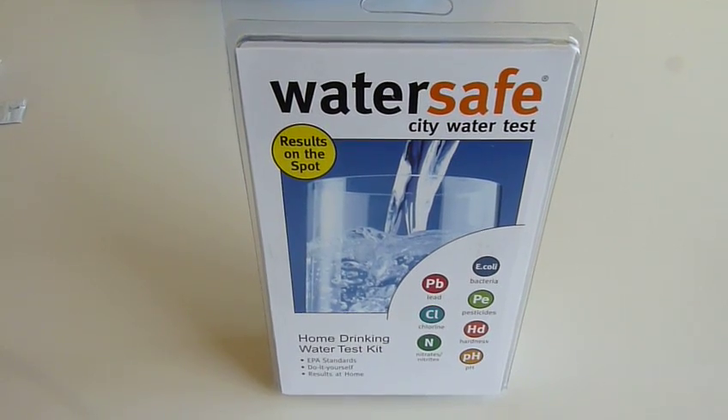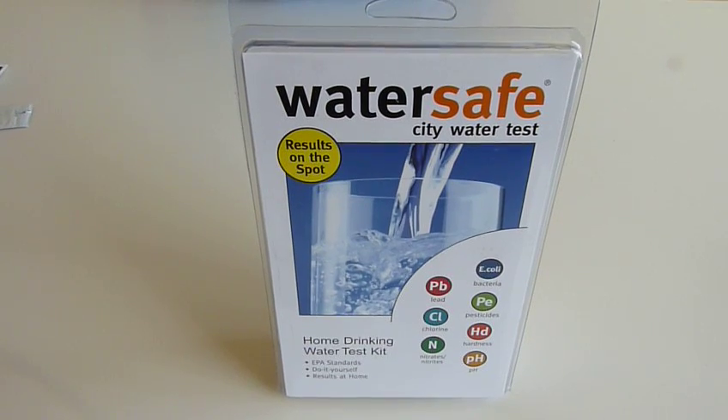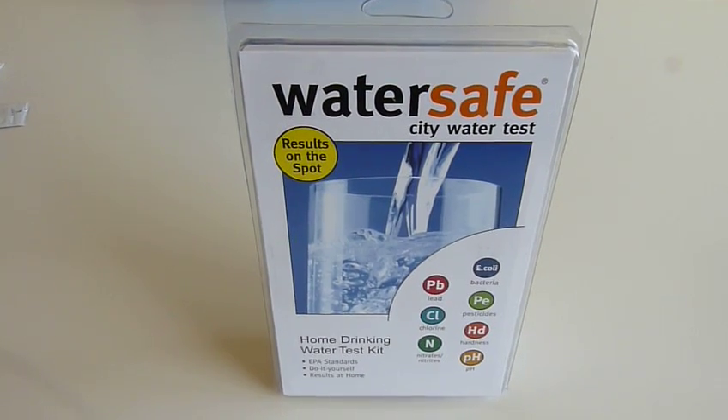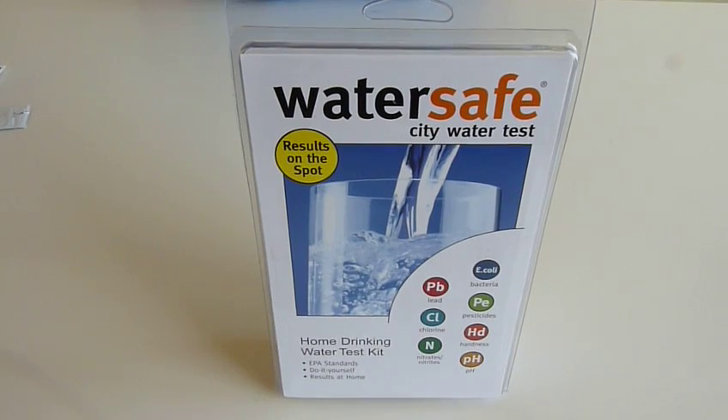Hello, my name is Carolyn from Simplex Health. We do receive a lot of inquiries from customers asking how they can make sure their drinking water at home is safe. Therefore, I wanted to show you today our City Water Test Kit, which is also known as the Drinking Water Test Kit.